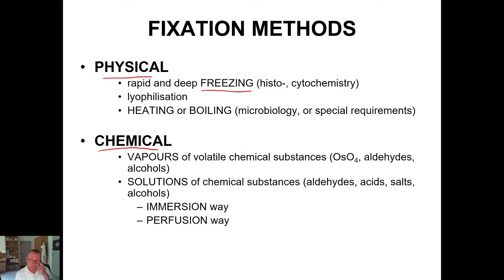The second and much more used fixation method is chemical. We can use vapors, but not very frequently. Much more often we use solutions of chemical substances, which can be very variable.